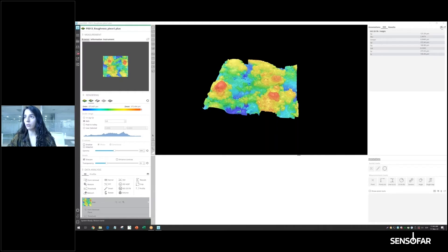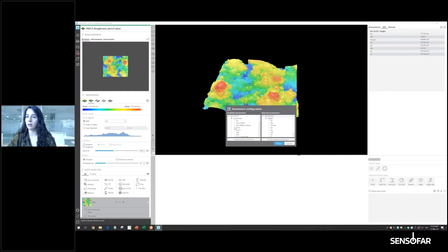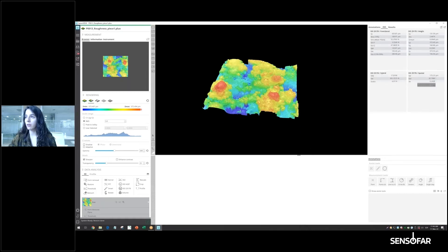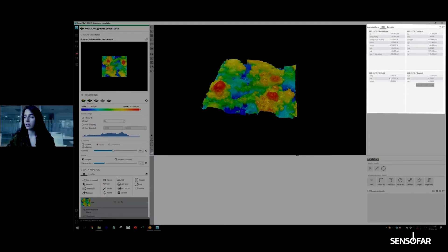I want to calculate more than just height parameters. I want to calculate functional parameters, hybrid parameters, and spatial parameters. Once we have added all those different parameters, we can see that the software is going to calculate all of them.